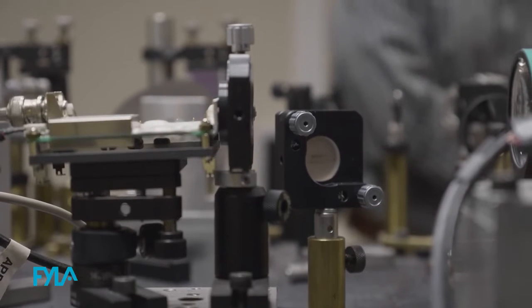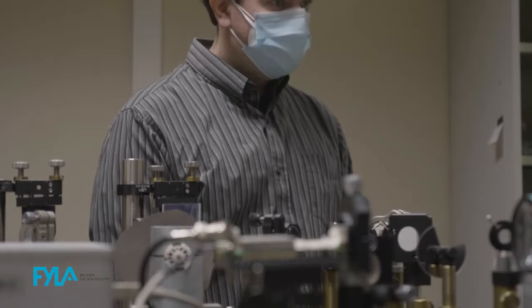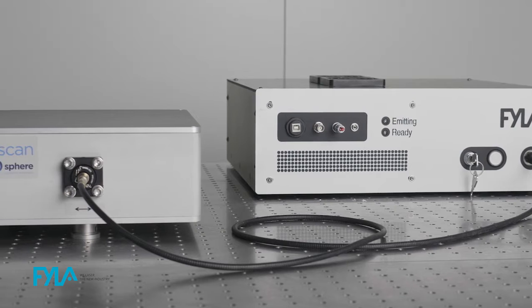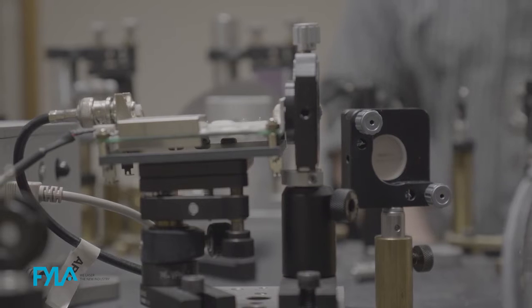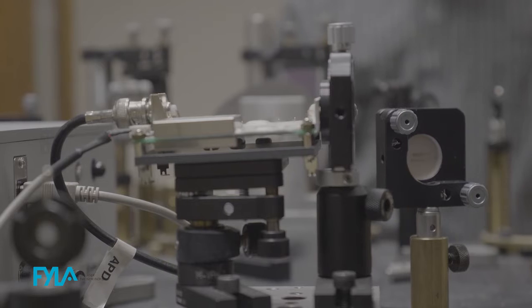Here at the Visual Optics and Biophotonics group in CSIC, we have made our own second harmonic generation microscope. And as with all microscopes, the first thing you need to consider is what your application needs to be. For us, because we want to look at second harmonic generation of collagen, the most important thing to start off with is your laser source. You need a laser source which is able to interact with the collagen in order to produce second harmonic generation. So something in the infrared range converting towards the blue, somewhere between the blue and ultraviolet range.